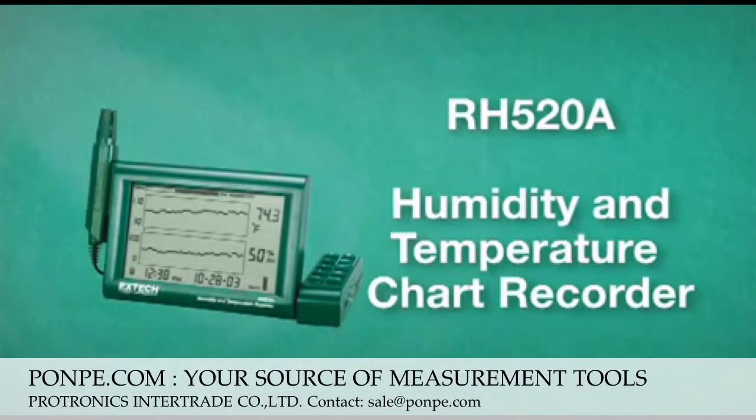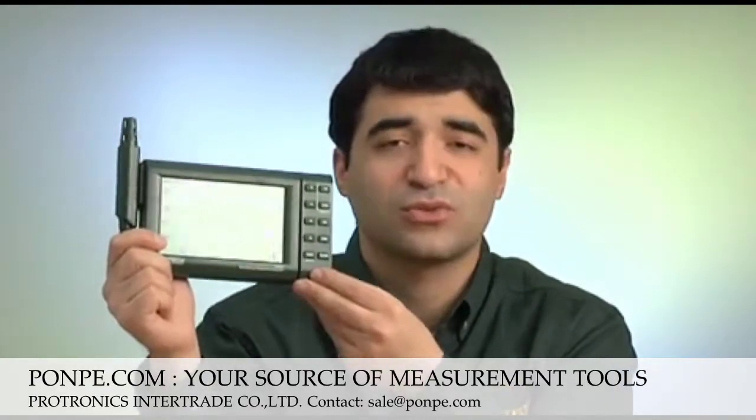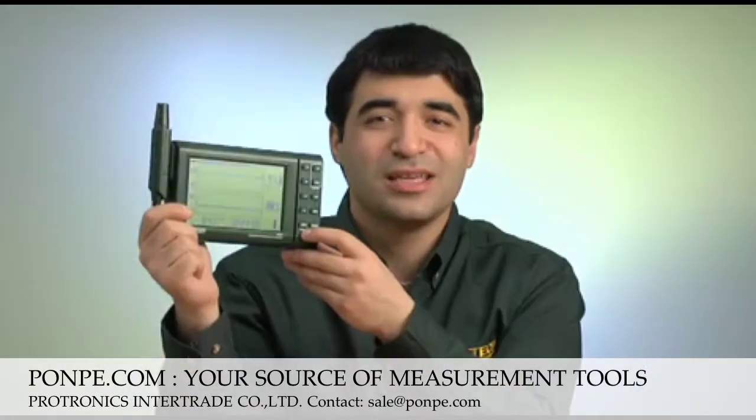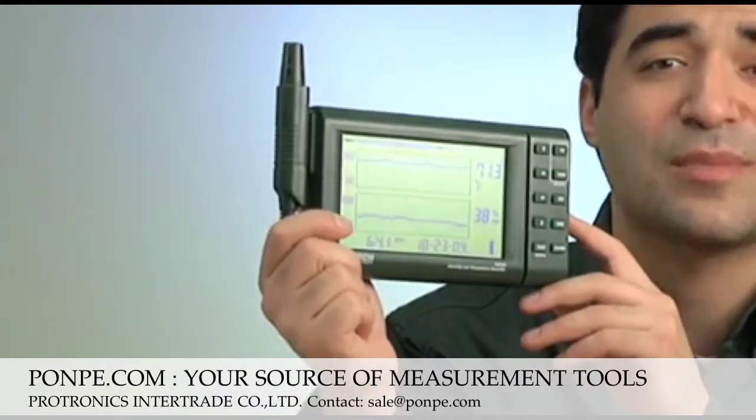The RH520A humidity and temperature chart recorder is a user-friendly, easy-to-operate paperless graphical data locker. The RH520 takes simultaneous humidity and temperature measurements, plus time and date.